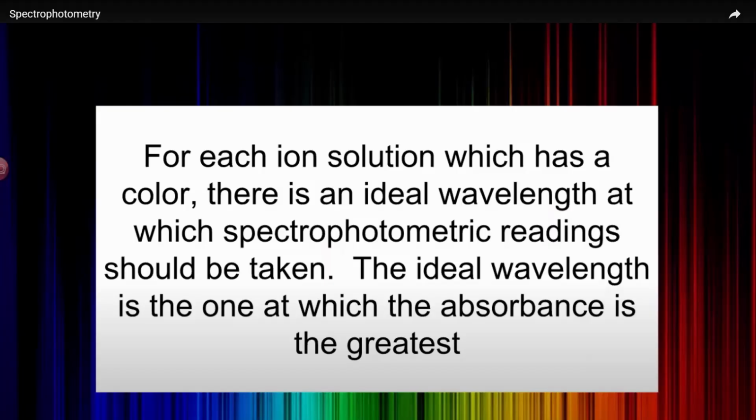But this is a really nice way to measure things, because let's say you have reactant A, reactant B, and you pour them together, okay? And maybe reactant A is purple. Pour them together, and the purple color starts to get lighter and lighter and lighter. Why? Because purple stuff is getting used up, so it gets lighter and lighter and lighter.